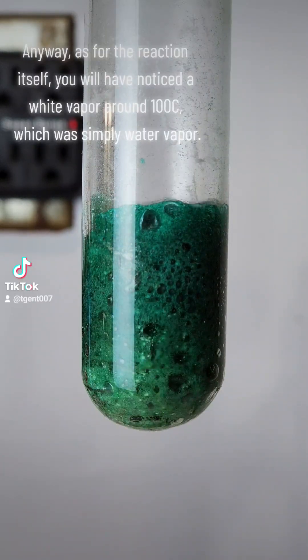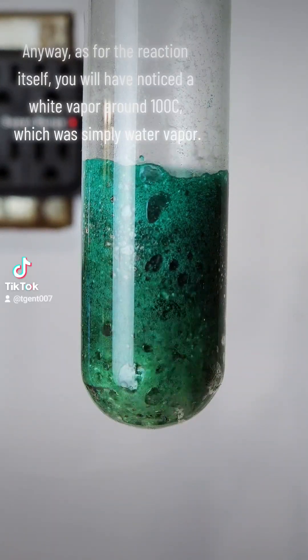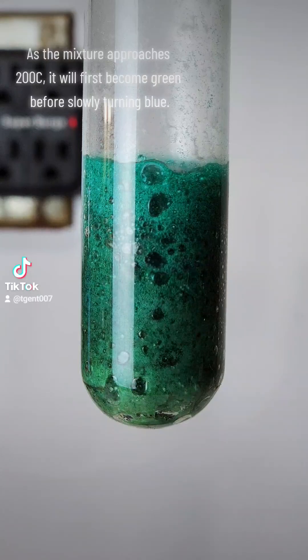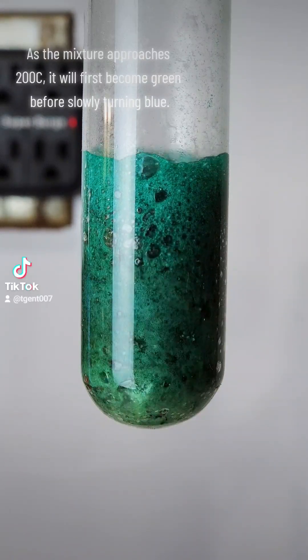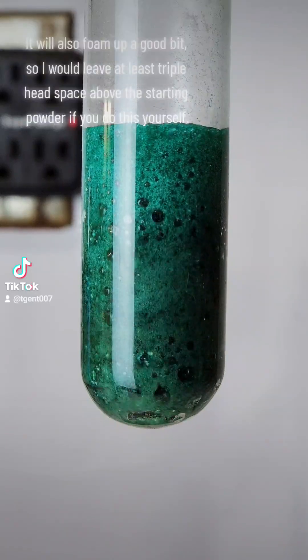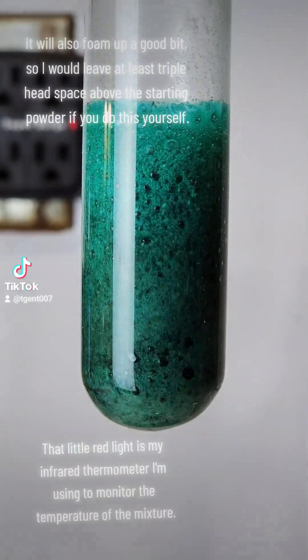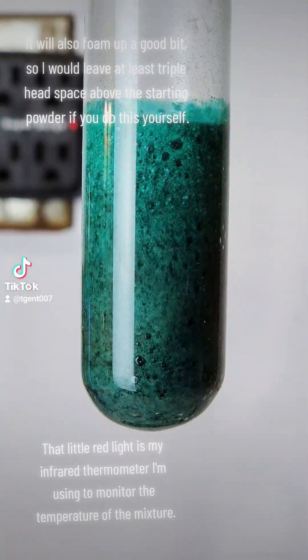As for the reaction itself, you will notice a white vapor around 100°C, which is simply water vapor. As the mixture approaches 200°C, it will first become green before slowly turning blue. It will also foam up a good bit, so I would leave at least triple head space above the starting powder if you do this yourself.